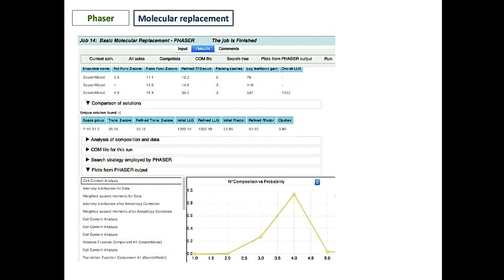We searched again for three copies. It found a solution. Now you can see the clear difference from the output that CCP4i2 is telling you. It even tells you it found a unique solution. But if you miss that, because it's in small letters, if you look at the stats, it actually has a TFZ of over 30 and a log likelihood of over 1,000. So it's very clearly solved it.